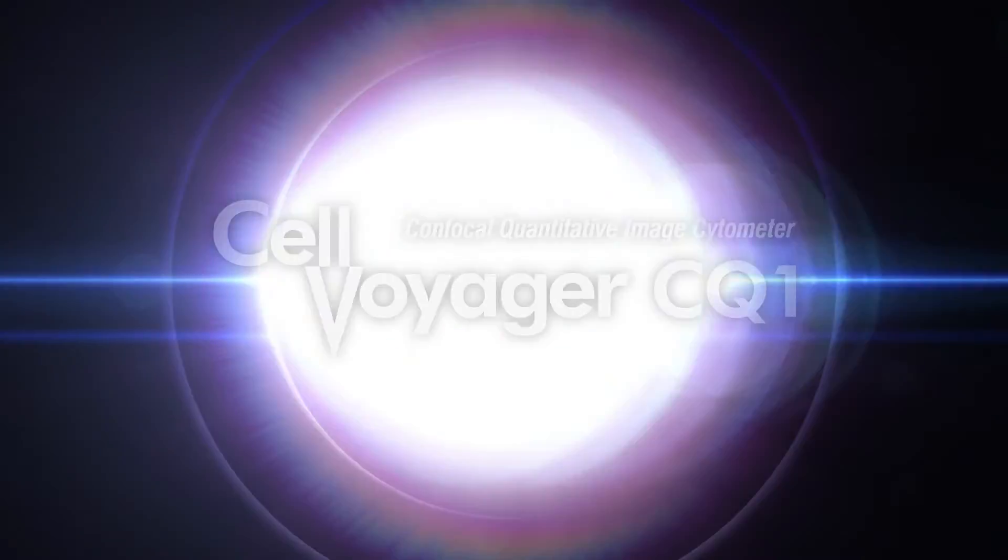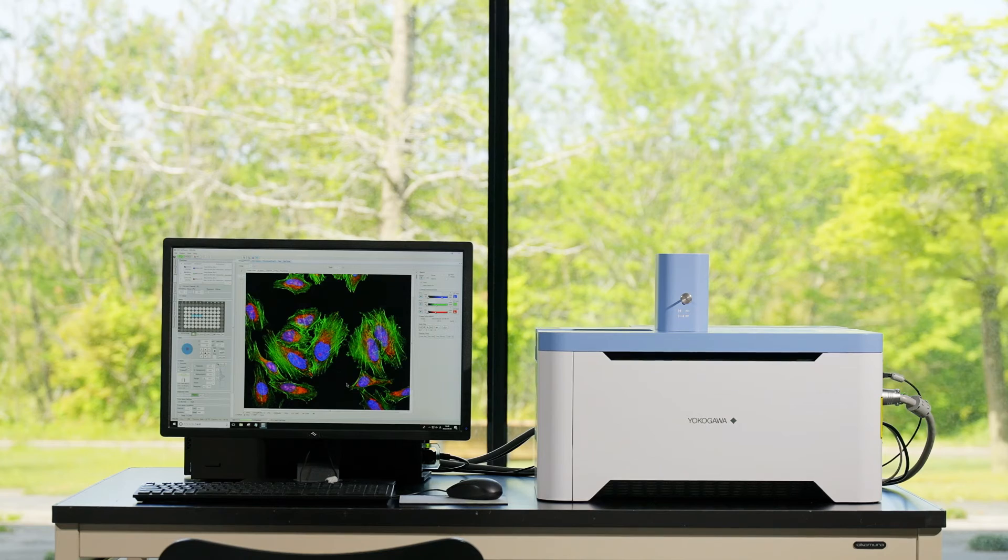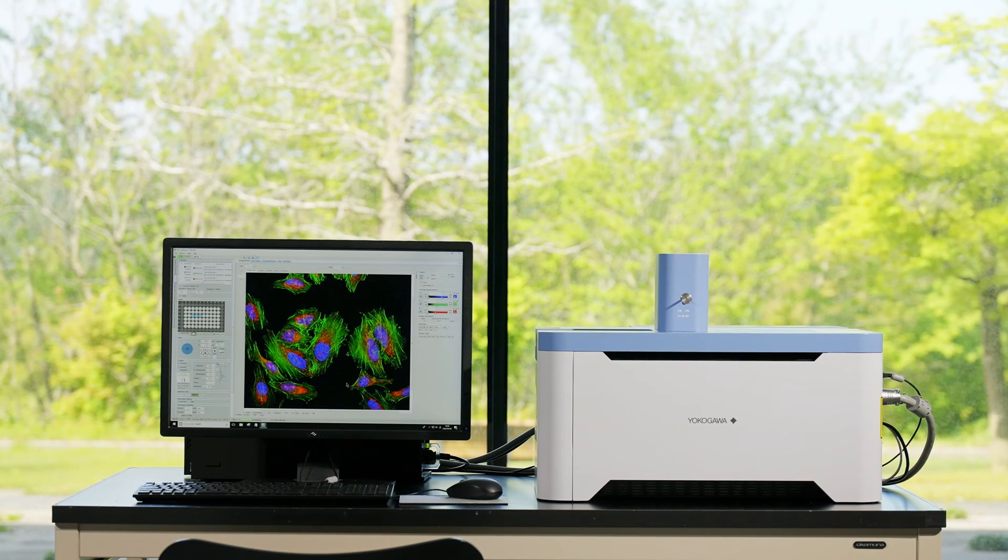Cell Voyager CQ1 can respond flexibly to diverse demands and can be integrated with small mechanisms to create clinical precision-scale solutions and expand the possibilities for your research.